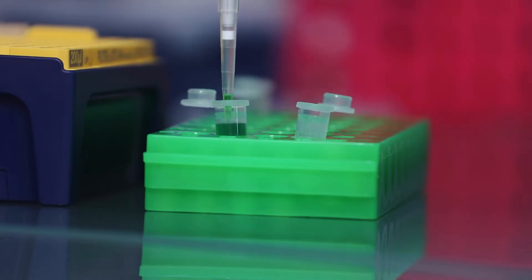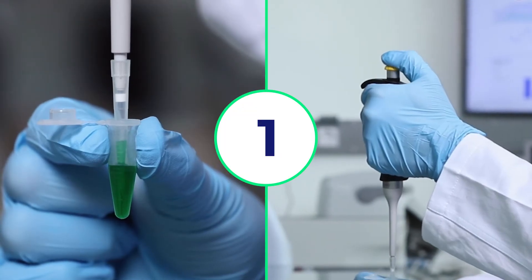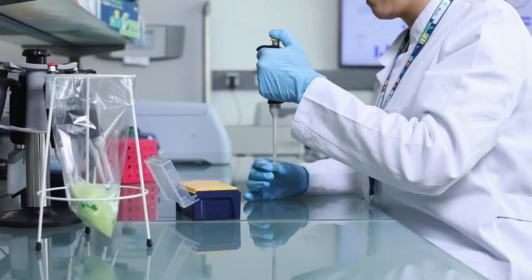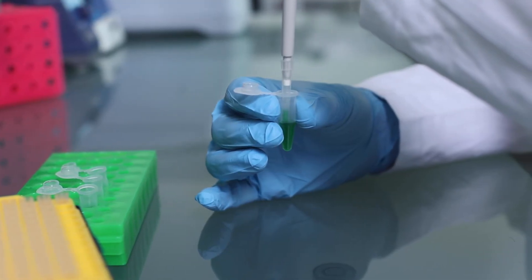Pre-wetting three to five times saturates the dead air inside the tip and tip cone to reduce evaporation of your sample. Slowly release the plunger, then press the plunger down to the first stop again and aspirate once more. Repeat this a few times. Remember to pre-wet your tips to ensure accurate and repeatable results.